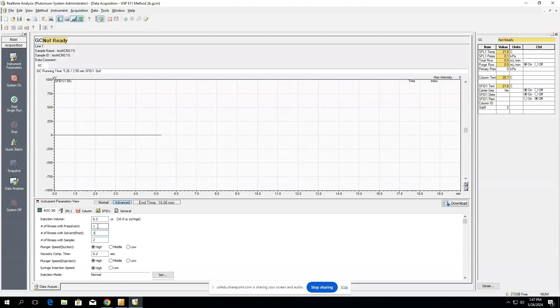So we might want to wash the syringe once with solvent before, and then rinse twice with sample, then inject, and then rinse with solvent again after, before moving on to the next injection where it will repeat one pre solvent, two sample rinse, one post solvent.